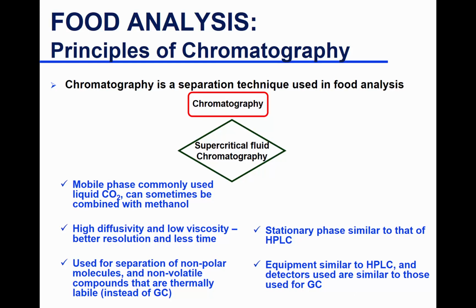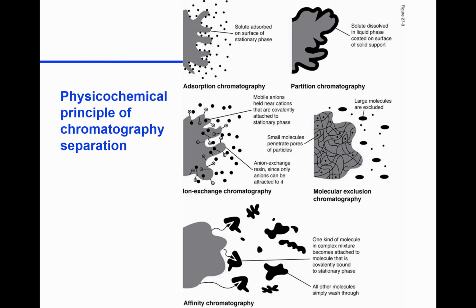Okay. So now that we introduced all types of chromatography, we're going to talk about mode of separation. Or in other words, the physicochemical principle of chromatography separation.